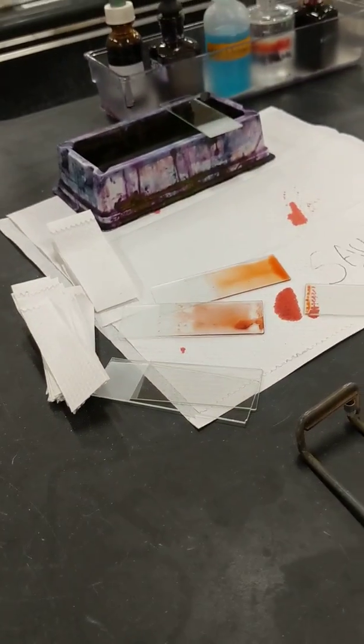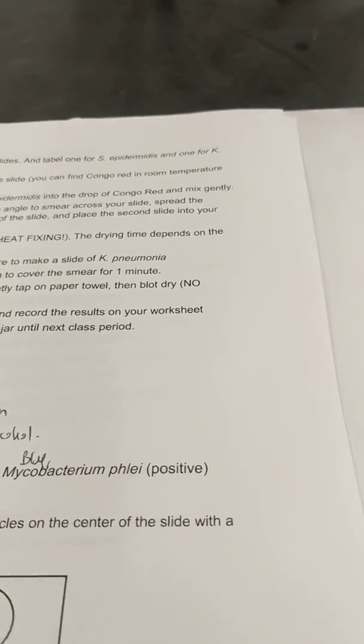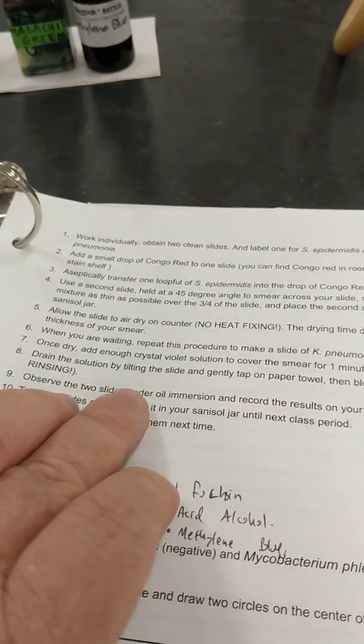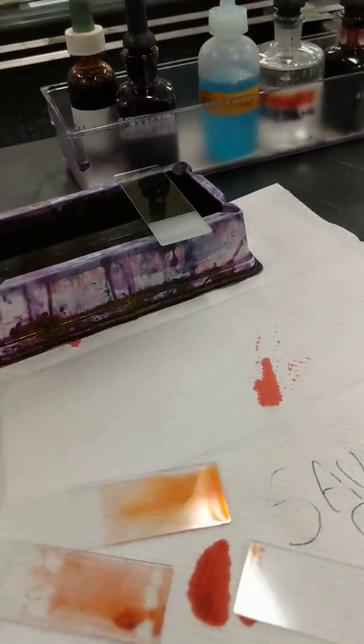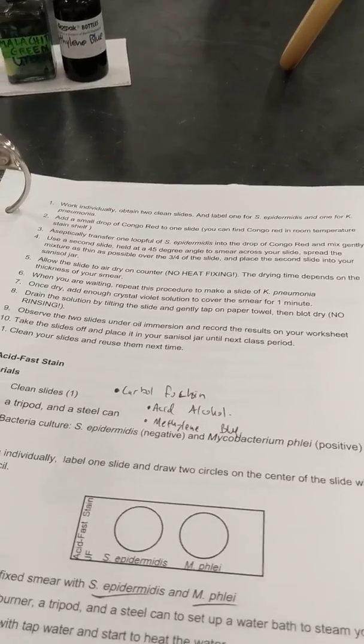Remember, we're not heat fixing these, all right? So no heat fixing. You're then going to counter stain it with crystal violet. The crystal violet is in your materials in here, so you'll counter stain it with that, and then you'll follow the directions. Okay. Next, we're doing the acid fast.